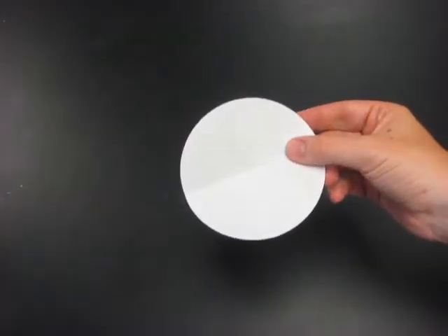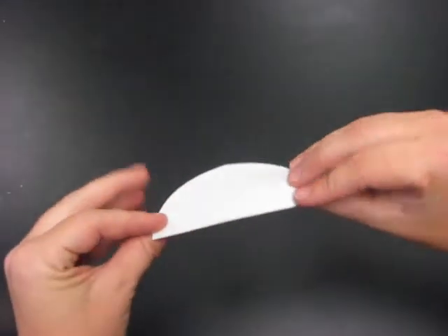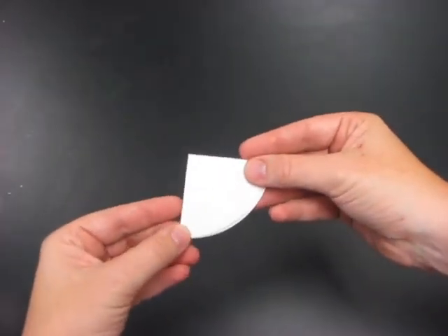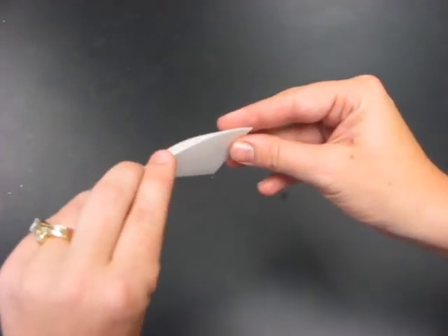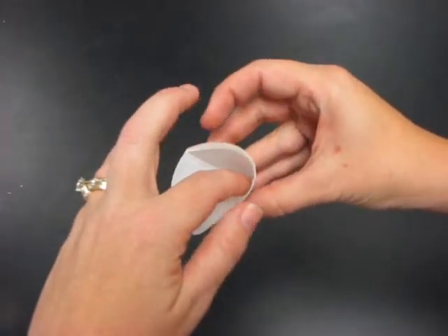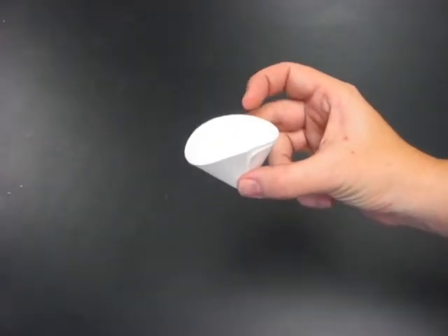Step 12A on day 2 requires you to fold a piece of filter paper. The way you're going to fold the filter paper is take the circle and fold it in half, like so, making a nice half circle. Then you will fold it in half again, into 4s, and then if you turn it to the side, you will find a little flap that you can then open, and you can see it makes a funnel shape, and that goes straight into your funnel.